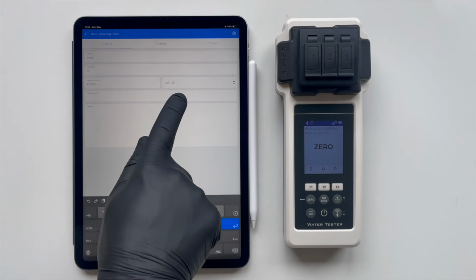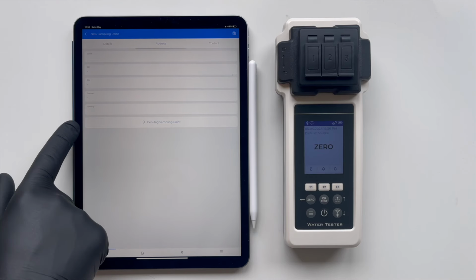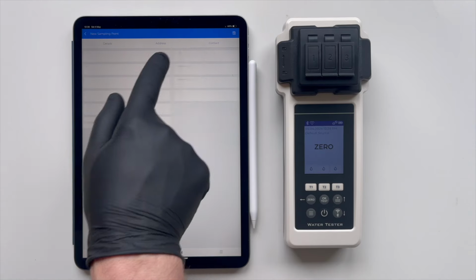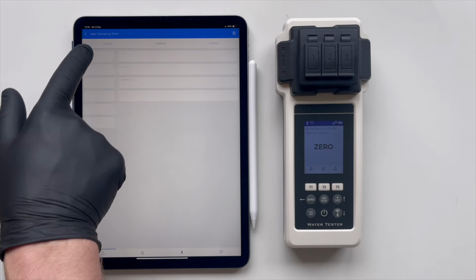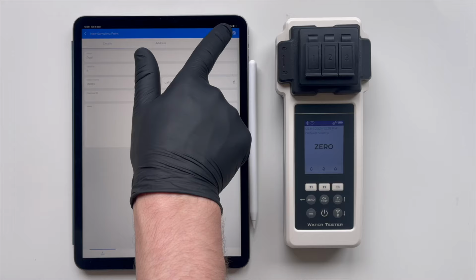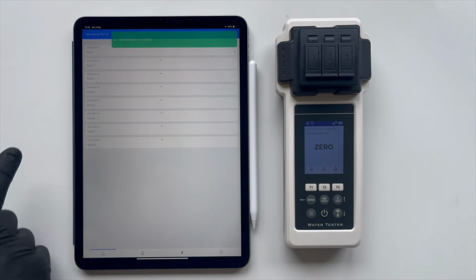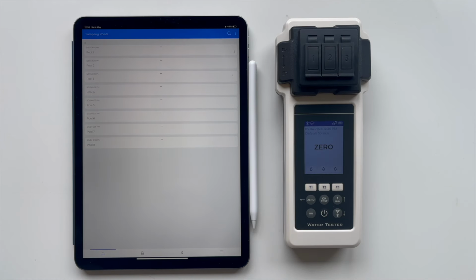Next, you have the option to enter the address where this site is located, which is handy for businesses to generate future reports, as well as the customer's contact information. Including the address ensures that each sampling point is geographically pinpointed, which helps in organizing and analyzing data based on different locations. After you've filled in all the details, click on the Save icon in the upper right corner to save everything. We've now added and saved the 8th sampling point.